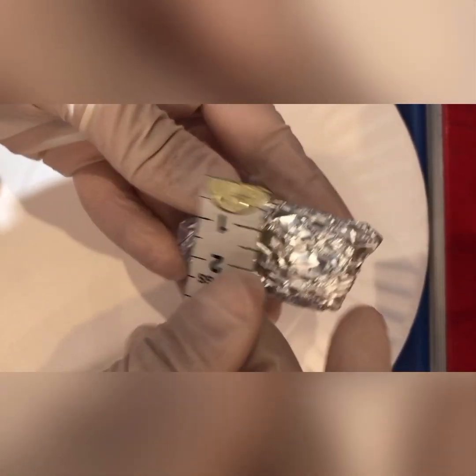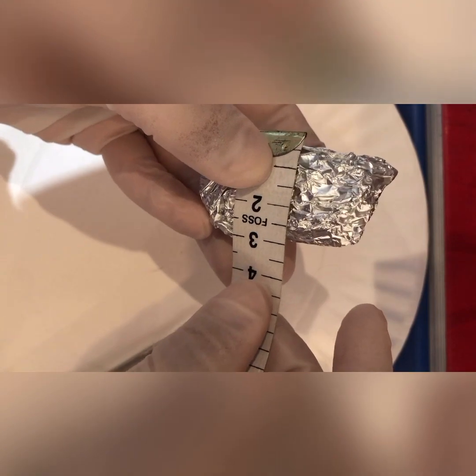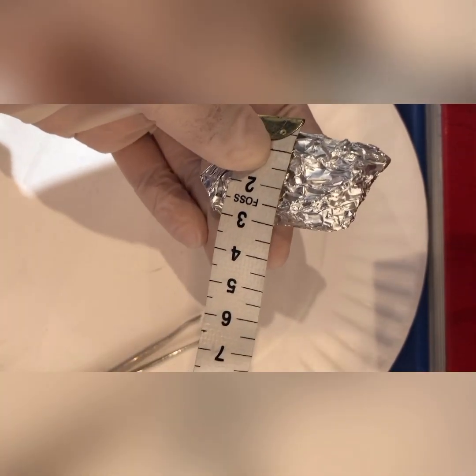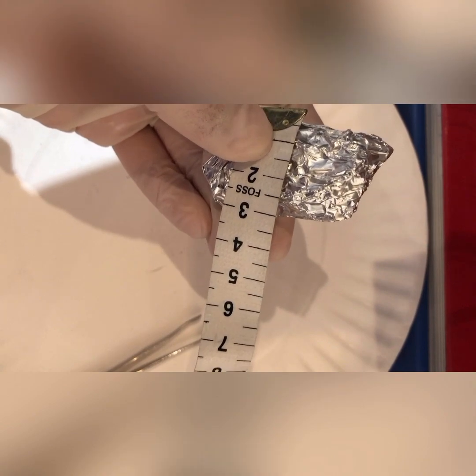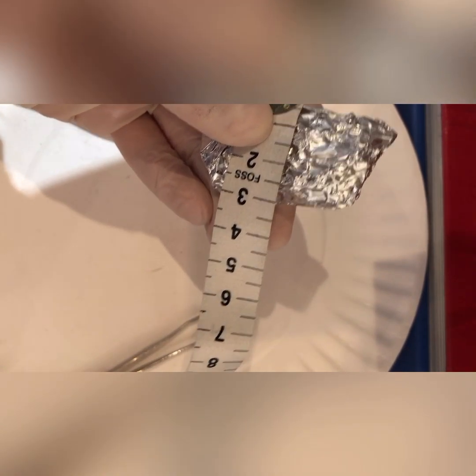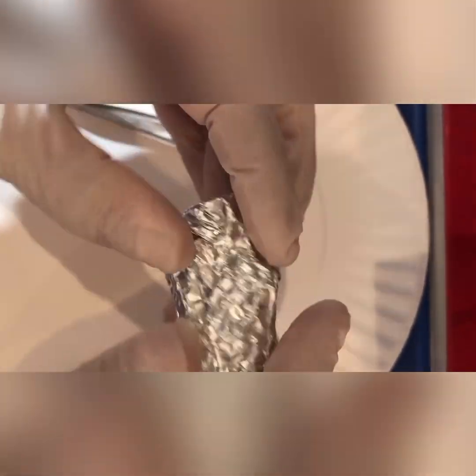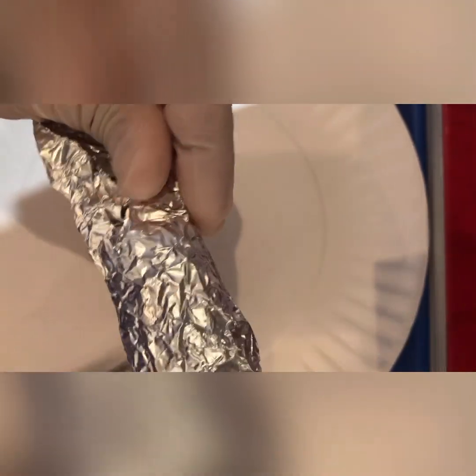And I'm also going to measure the width, and the measurement of the width you'll see is a little bit under 3 centimeters. And the reason we measure is to see the size, to find out what kind of a meal this owl had right before it regurgitated. So I'm going to open it up and unwrap it and look at it.